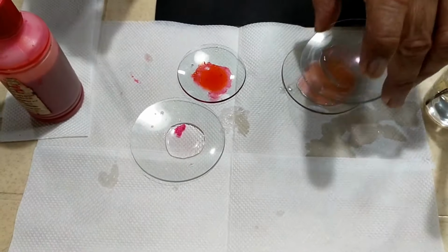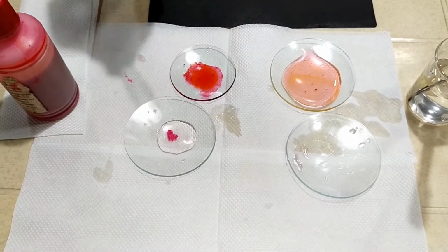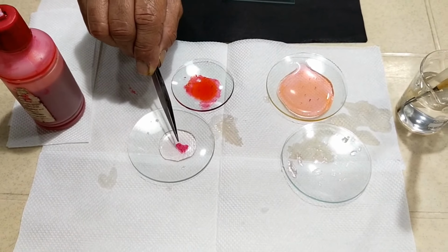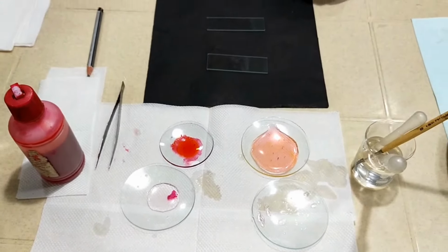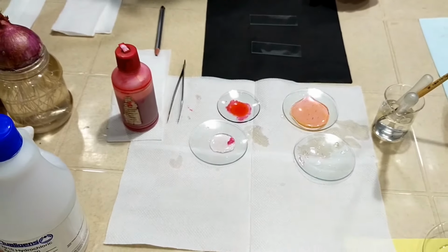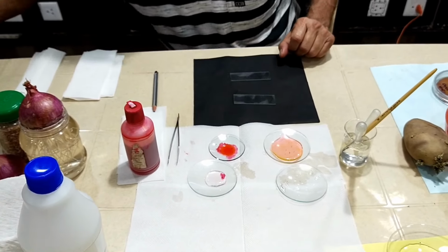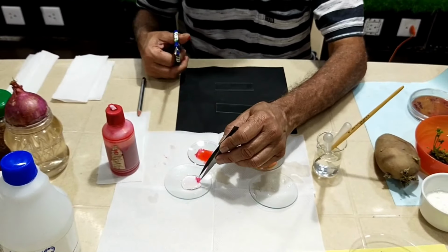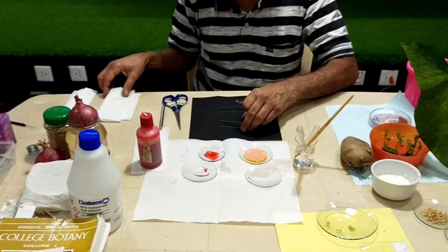That's very fine. So now you can see this is stained fine, and I'll take a small piece. You can make 5-10 slides out of this piece. You require a very small piece. I'll use the scissors to take a very small piece. This is the only scissor available. It's okay, fine. I'm now going to take a drop of water here. I think I'll still use the white background, that is still better.